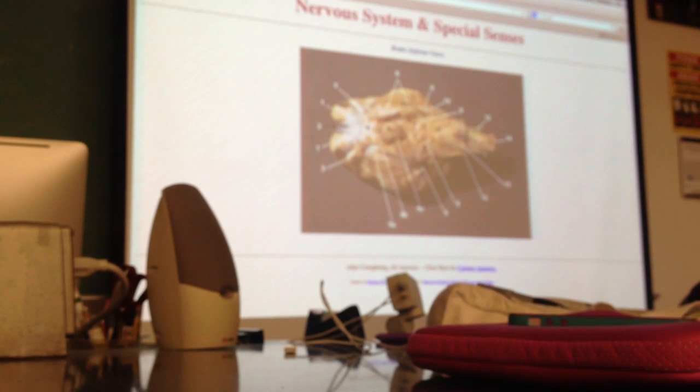So we aren't going to be able to see the mammillary body externally, or well enough to identify it, so I only want you to worry about it internally. But the cerebral peduncles will be external. To either side of the pituitary gland, if you lift up the meninge, you'll see the peduncle.